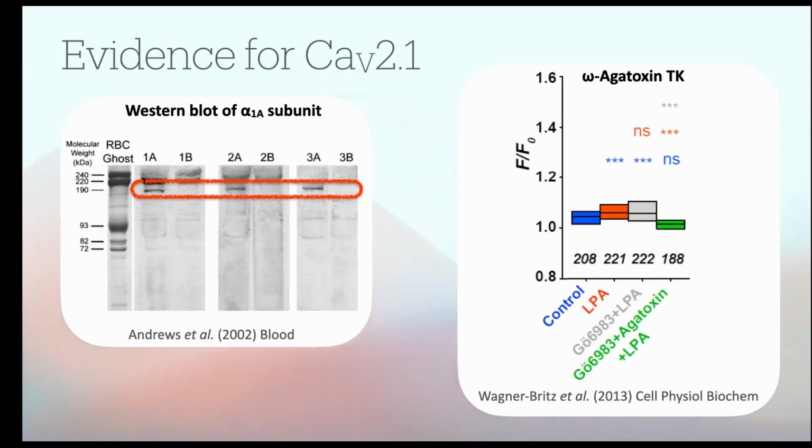On the other hand, if we look at these calcium imaging experiments, as you see it on the right, this is a method where signal is integrated. So even if you have very small signals that you may not be able to see, you can over time integrate the function, and then you see, well, even significant differences. So what is this all good for?